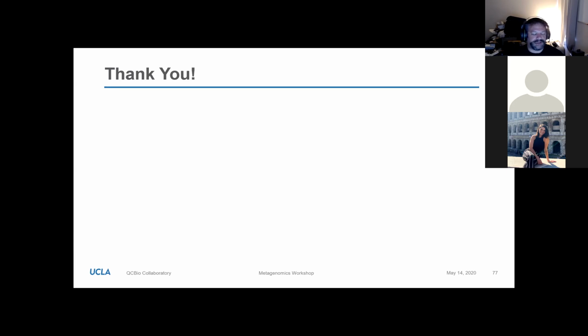And as I mentioned, I spoke to some of the people at Zymo who do the marketing and making the educational videos. And I'm going to have an educational video out probably next week at some point. And it's going to be on the ASV versus the OTU method, because I think that's actually an underappreciated area in microbiome, especially for people doing targeted sequencing.